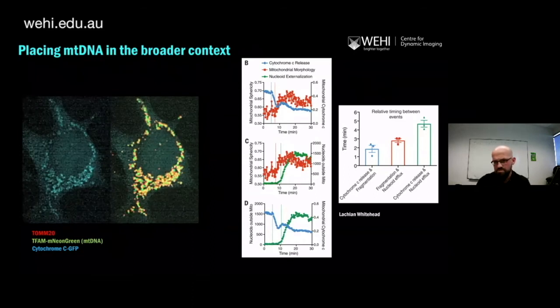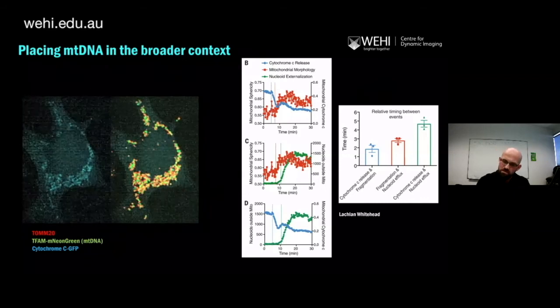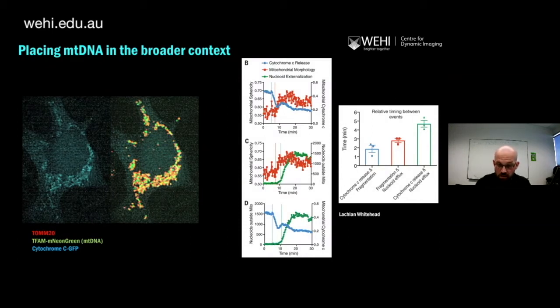time points. Now, when I came to this project, the work was quite mature, and it was at a point where Kate had submitted a majority of this to Science, and Science had come back to her, as Science does, and said, wow, this is fantastic work, but could you also do X, Y, Z, all this other 100 terabytes' worth of experiments?